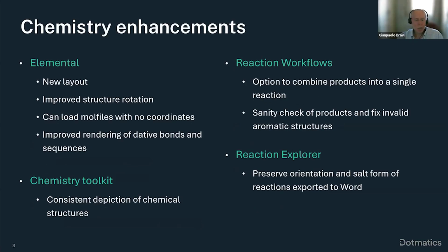Okay, let's begin with chemistry. We made important improvements to Elemental, both in terms of UI, UX, and new functionality, to the chemistry toolkit, where we've done work to consolidate the depiction of chemical structures and chemical reactions across different platforms, and our cheminformatics application, reaction workflows and Reaction Explorer.